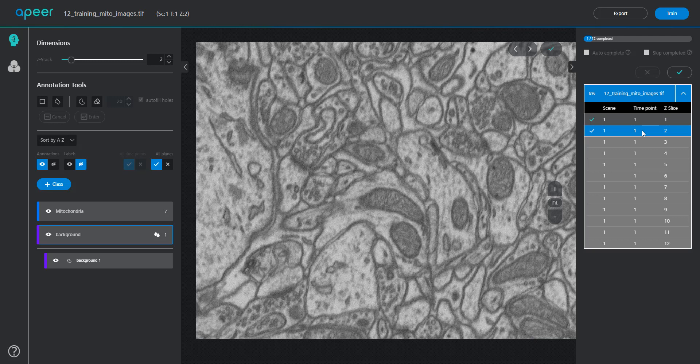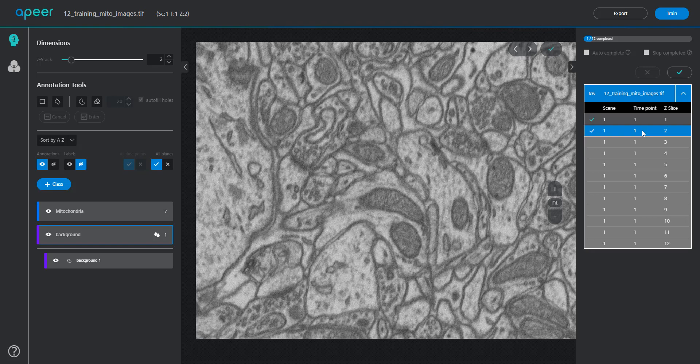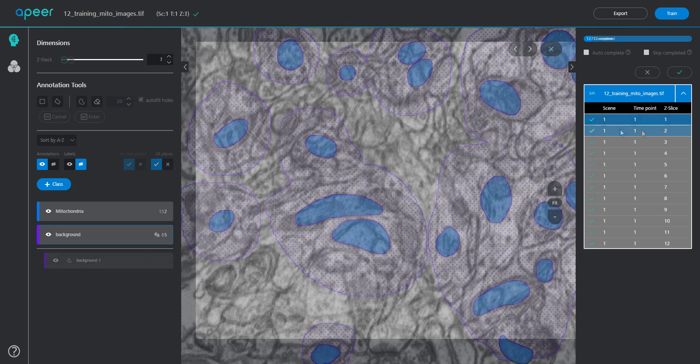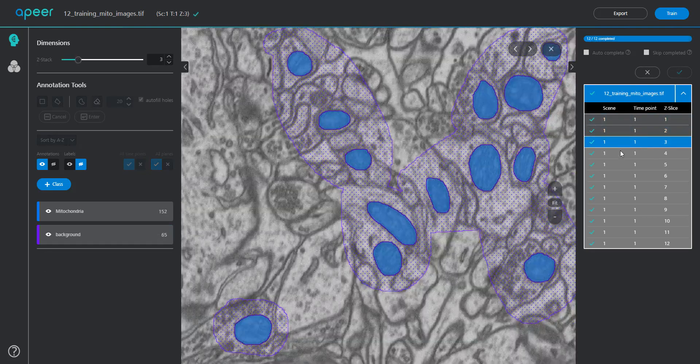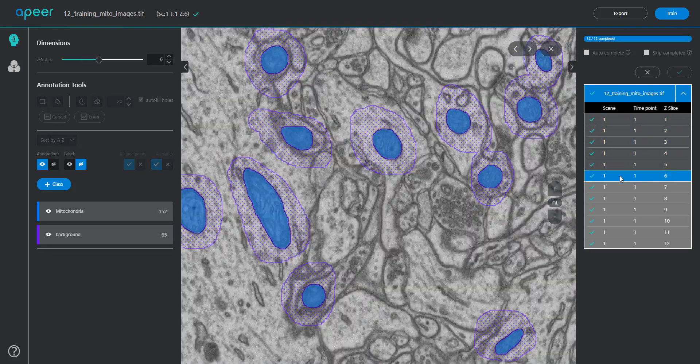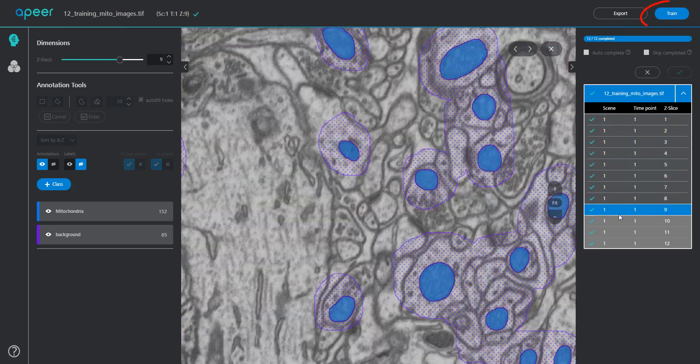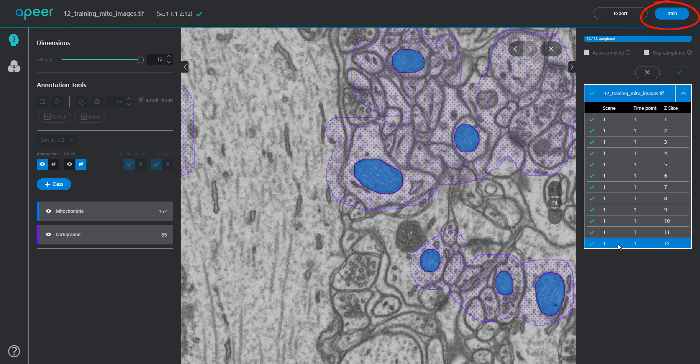And please remember that you do not need to annotate all images in your dataset. Once you're confident about having enough annotations, hit the train button to start the training process.